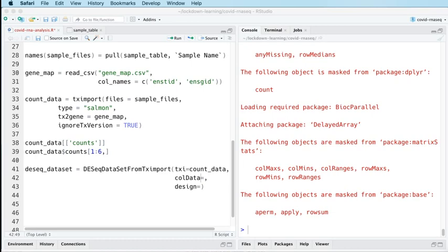If you're on Linux, then install libxml. So at the command line, do sudo apt install libxml. It might be libxml2 or it might be libxml dev, but you need one of those to get the libxml headers to be able to install the XML package on Linux.